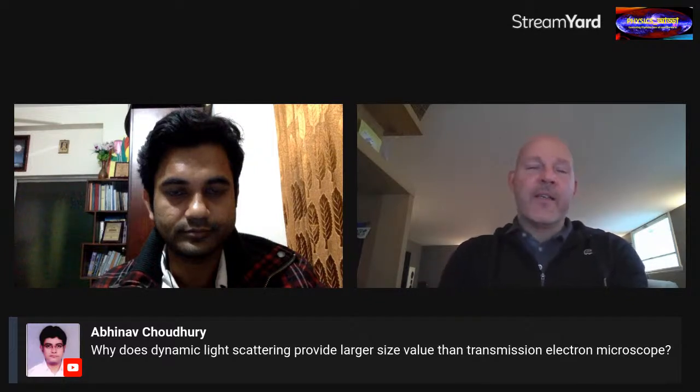For the electron beams that I was talking about today, ones that have a kinetic energy on the order of 100 kilovolts or so, the de Broglie wavelength, the effective wavelength of the electrons in that beam, is on the order of 3 picometers. So that's between 100 and 1,000 times smaller than the interatomic separations that are actually present in materials.